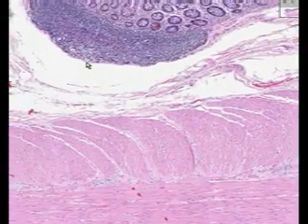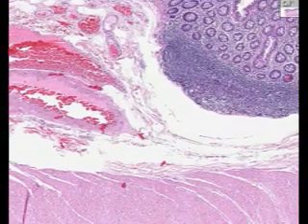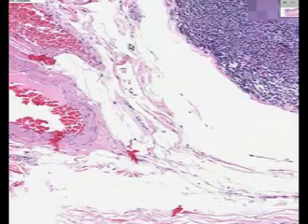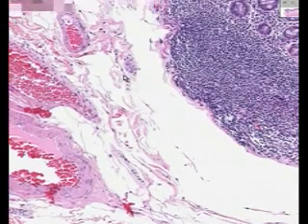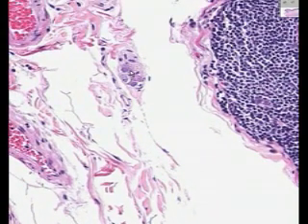let's go back to that. These are nerve cells of the myenteric plexus. Notice that there's another area which you may find ganglion cells, and it will be in the submucosa. And they're a little bit harder to find, but if you are patient, you can probably find some. And do we have one here or not? Looks like, yeah, here we go. We're lucky. We found a submucosal ganglion as well, part of the autonomic nervous system of the colon. There's a submucosal ganglion.